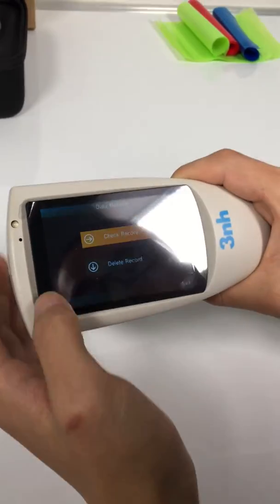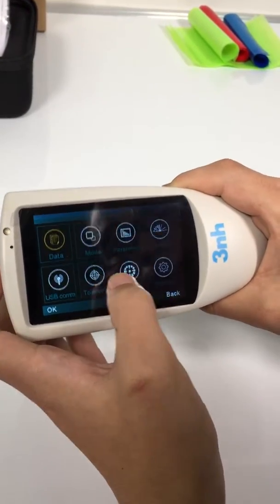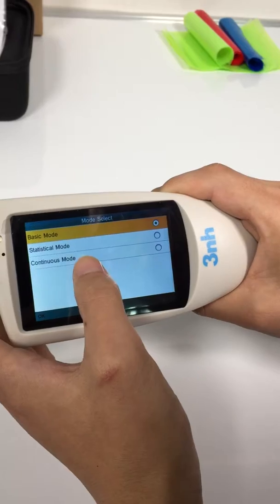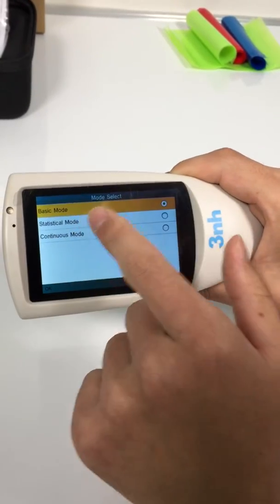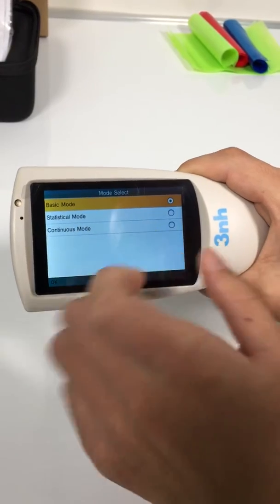Data — you can check records and delete records here. Mode — there are three measuring modes here. You can choose as you want: basic mode, statistical mode, and continuous mode.